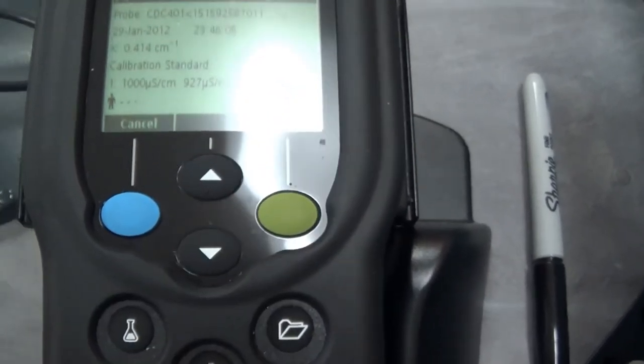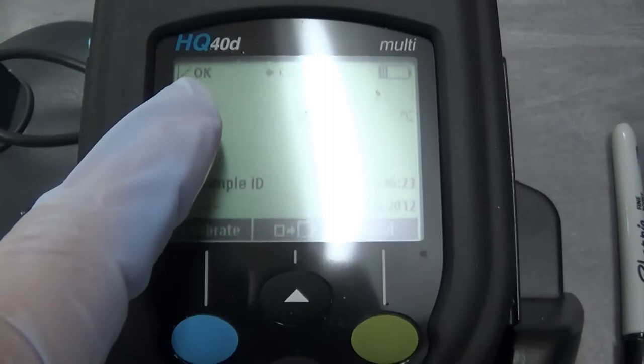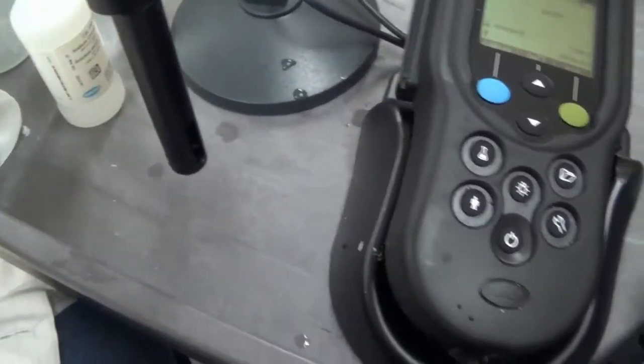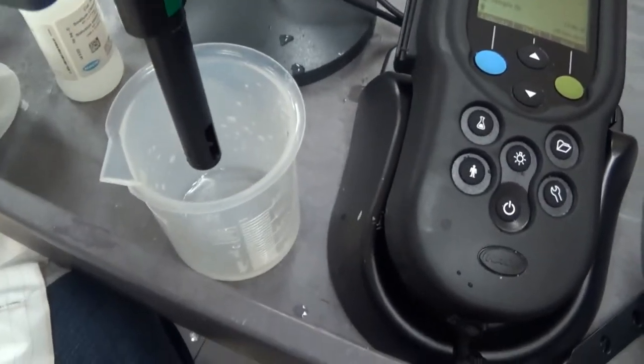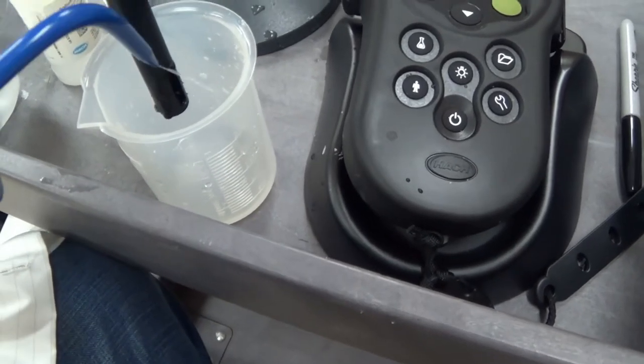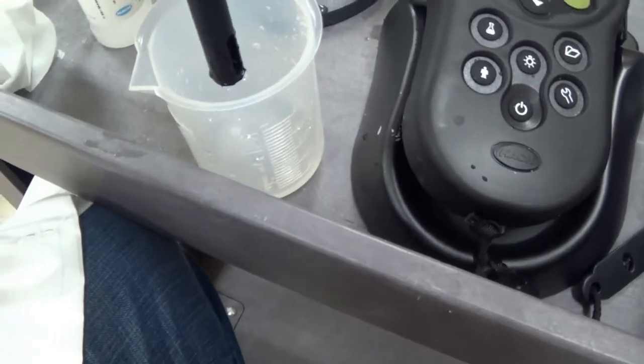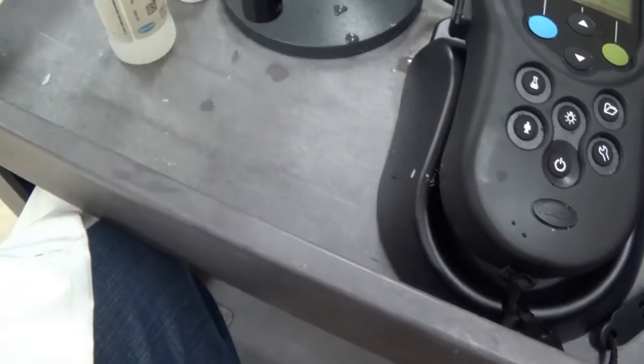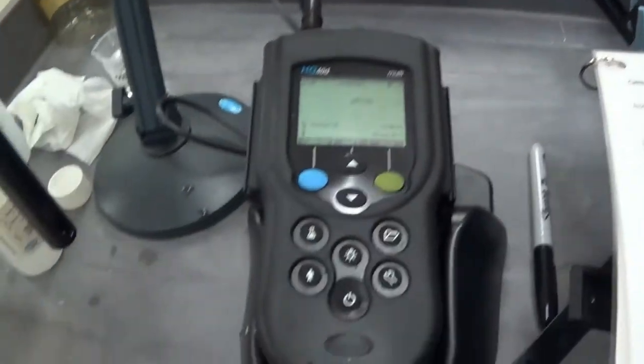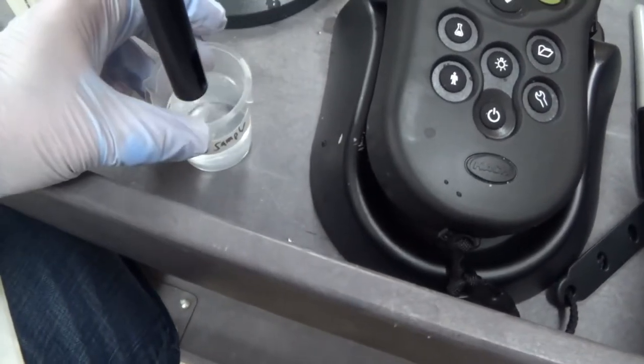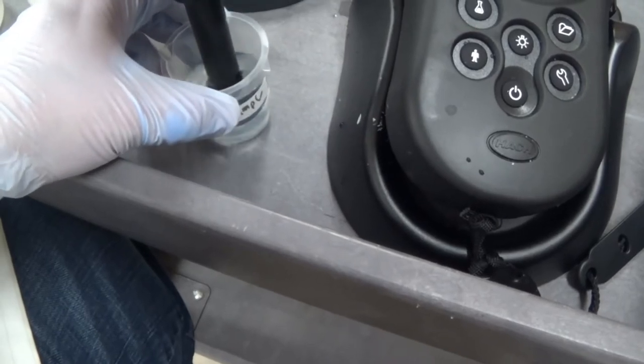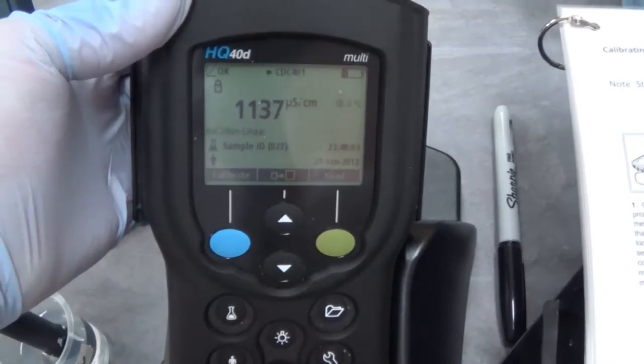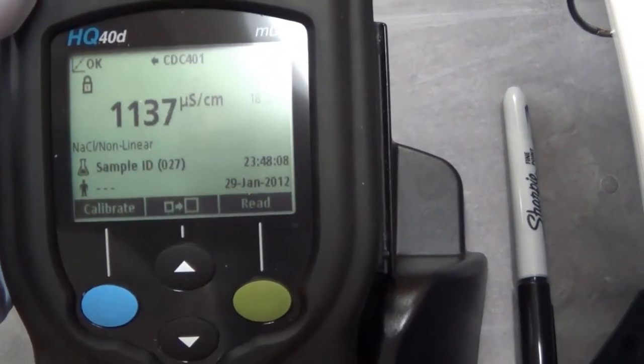I am going to take it out of my 1,000 standard. Rinse, rinse, rinse. Dry. Get rid of that, get my test sample. Put it in my well water from UWGB. Let's hit read. It is stabilizing. Finished and it is stabilized. This is our reading here from our well water from UWGB.